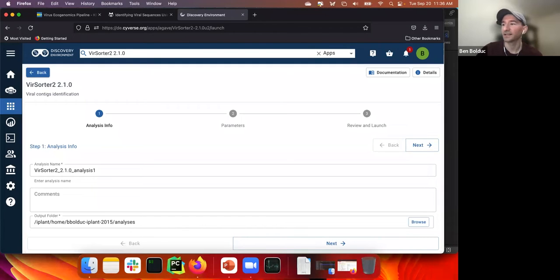If someone else has any other assemblers they think or know of that generate the assembly graphs, do let me know. I often use the assembly graphs to visually look at the quality of the assembly without needing to use some of the other tools, like QUAST or MetaQUAST, that I don't go over in here, but that's definitely a tool that I use to look at the overall quality.